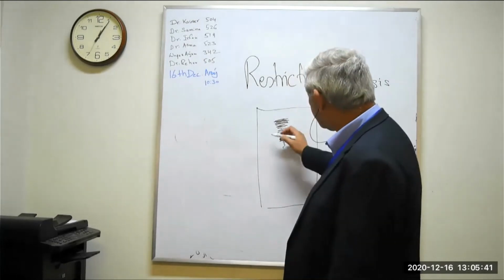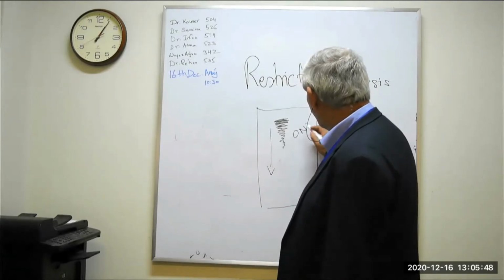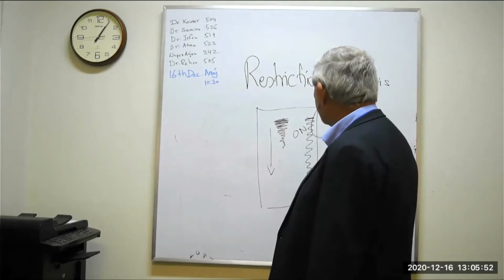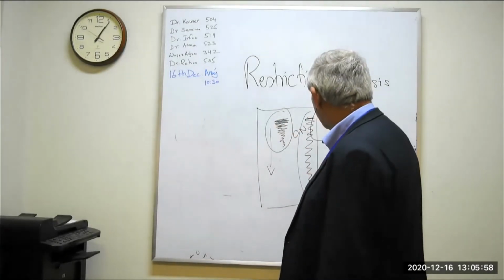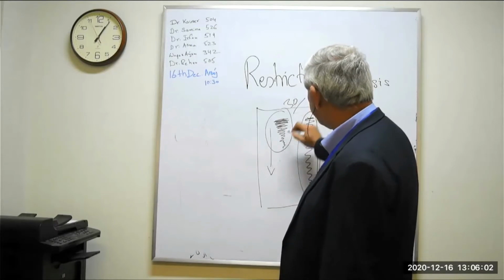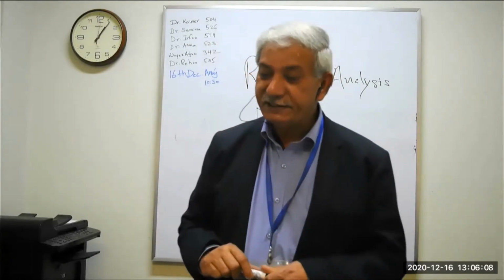That smear is not that long. If we incubate it overnight, then the smear gets too big, indicating a complete digestion. So you can see the digestion here, you can see the digestion here for 30 minutes. I'm expecting it like this.